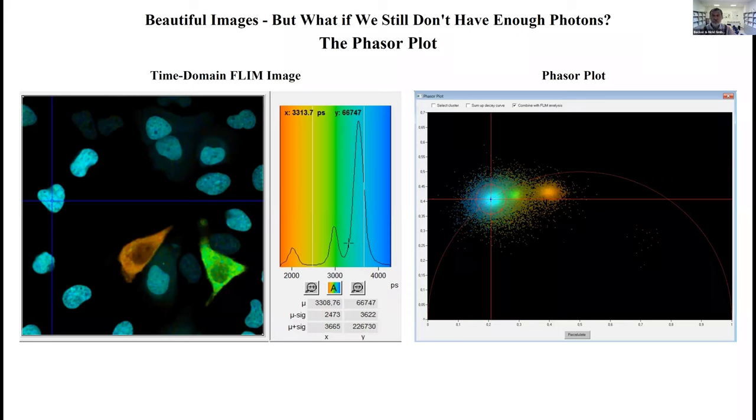Wonderful images, but still it can happen that you don't have enough photons. So what can we do here? Use the phasor plot. This is actually the point where in our software the phasor plot kicks in. What is the phasor plot? You take the decay functions of the individual pixels in the time domain image and Fourier transform them.